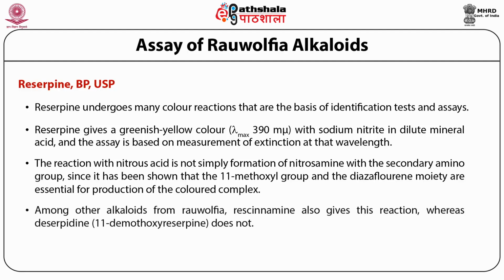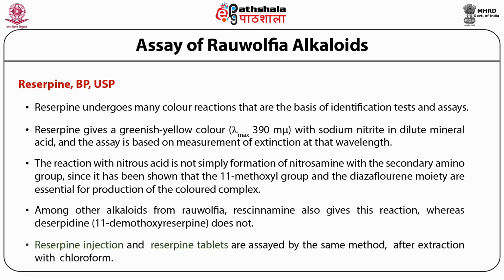Among other alkaloids from Rauwolfia, resinamine, which also contains 11-methoxy, also gives this reaction, while desreserpidine, which is 11-desmethoxy reserpine, does not give this reaction. Reserpine injection and reserpine tablets are assayed by the same method after extraction with chloroform.